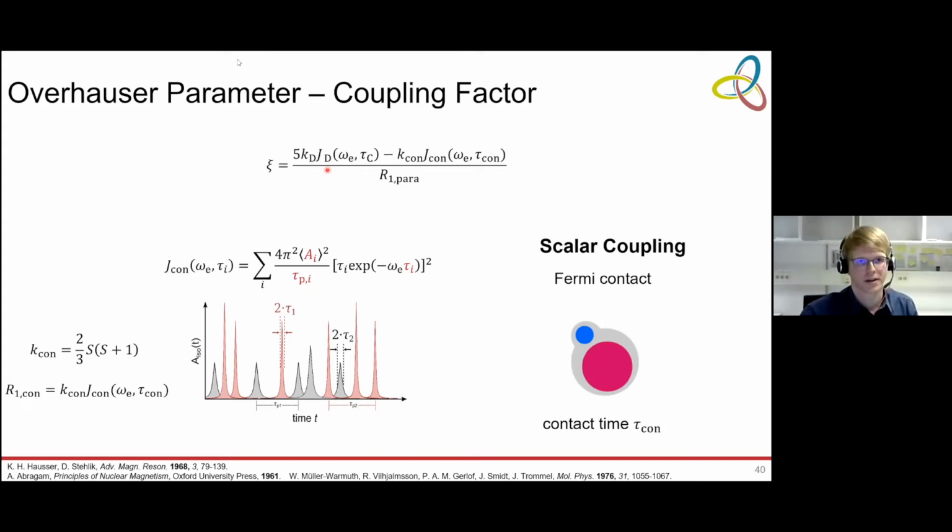If you don't work in a microwave cavity, you heat the sample a lot if you use polar solvents. I will also talk about this in a couple of minutes, in a bit more detail. But generally speaking, at high magnetic fields, it's a trade-off between using a microwave cavity, which restricts you in terms of volume, or using a non-resonant setup where you can use larger volumes, but then you have more severe heating effects.